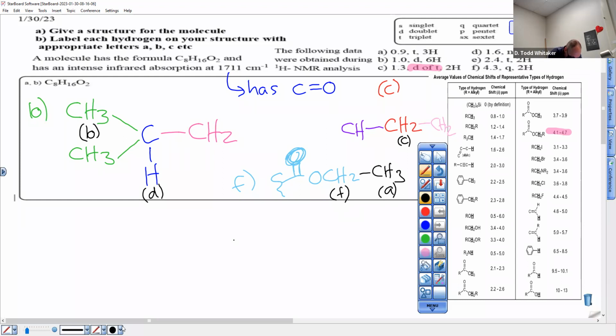I'm going to give it to you. So let's do an inventory. A's taken care of. B's taken care of. C's sort of taken care of. I'm not going to cross it off. D is done. F. So we're CH2 short probably with guys 2.4.